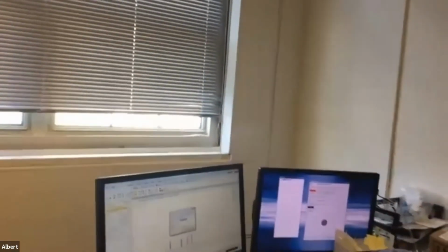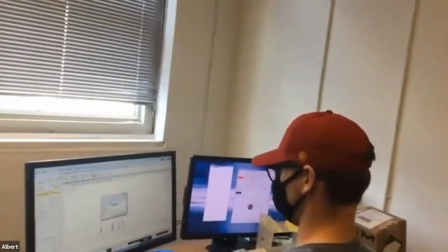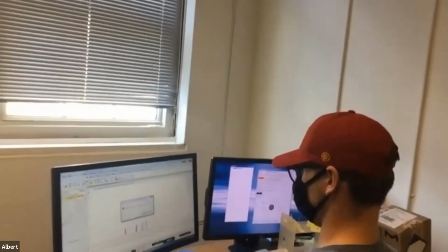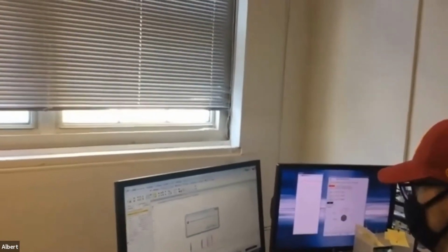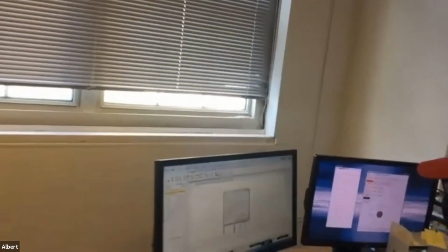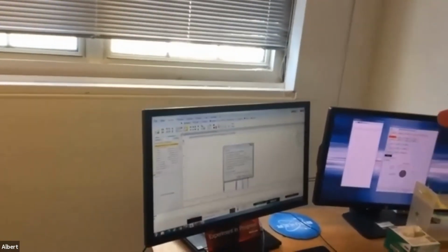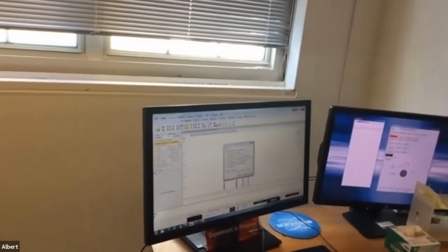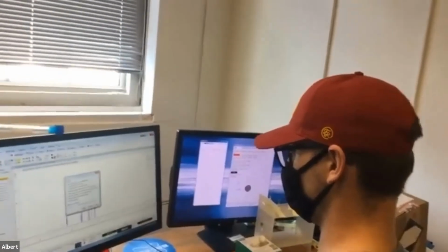Change the name and click OK. And then is it still not working? Just cancel. Let's save it somewhere else. Close it. Yep. Close. Cancel. And then go to file. Save as. Save data set. Save other. Oh, that's right. Right there. Right here. And then go to OK.